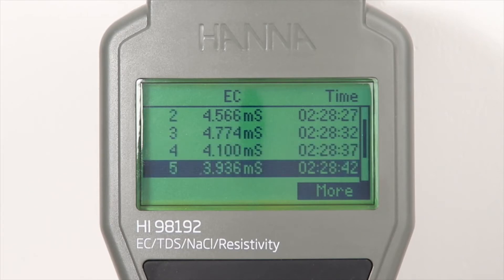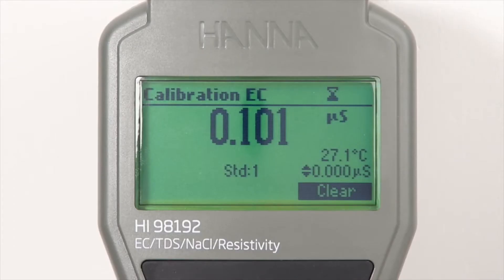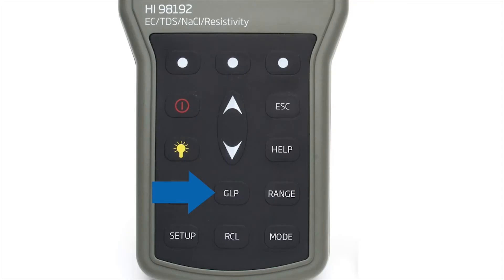Pressing the dedicated cal button allows users to enter automatic calibration. Up to 5-point calibration can be performed with the choice of 7 memorized standards. Calibration data is stored upon exiting and can be reviewed by pressing the GLP button.